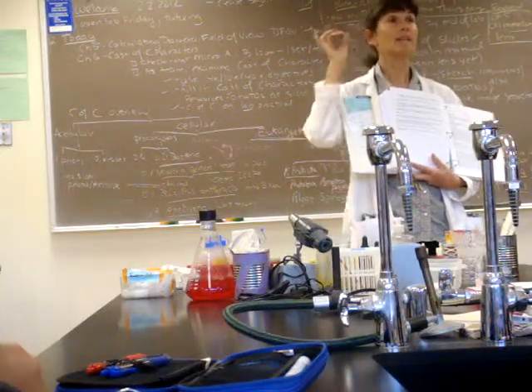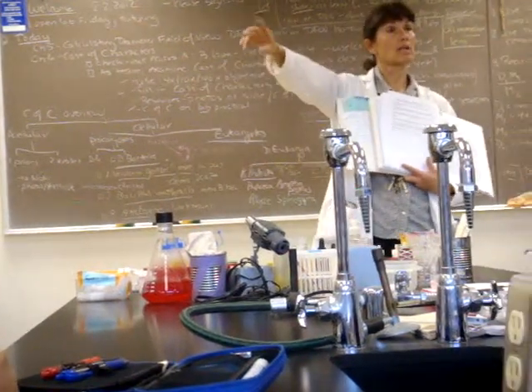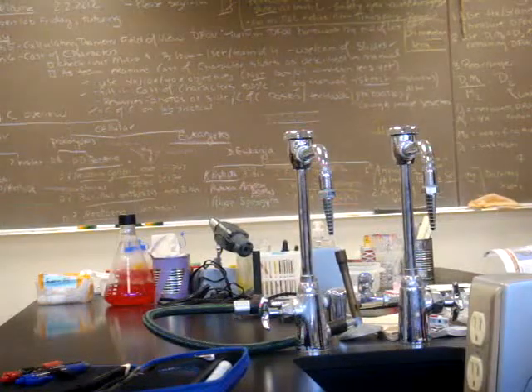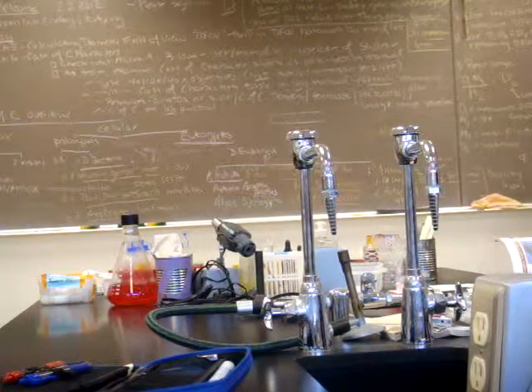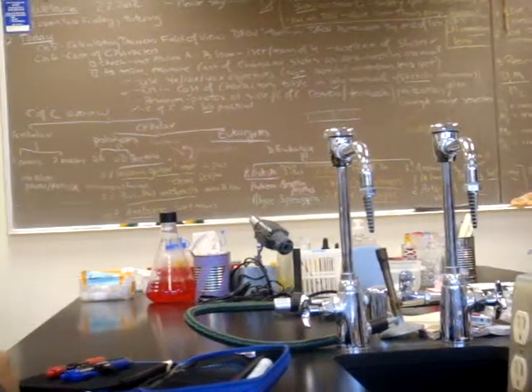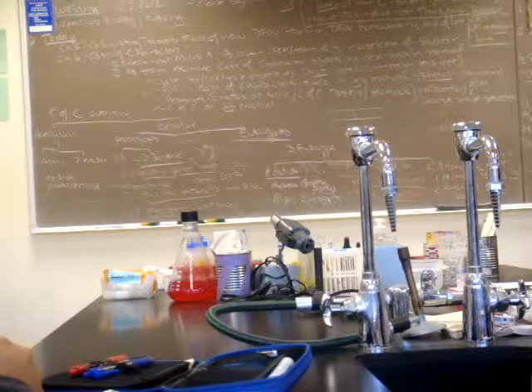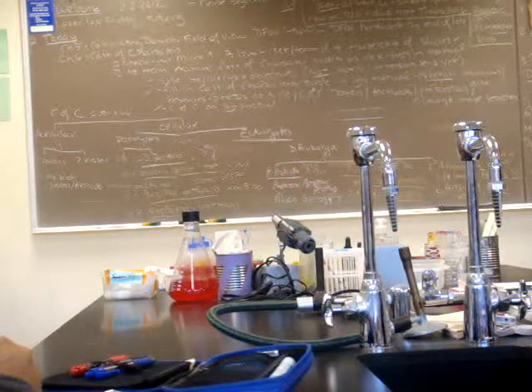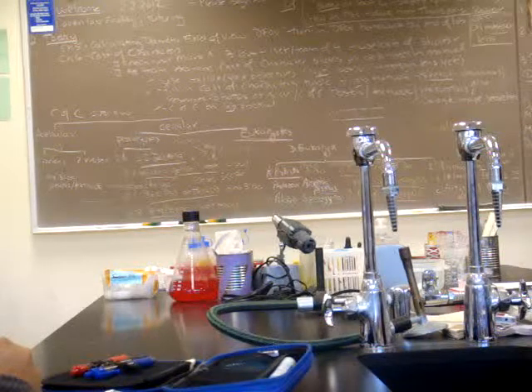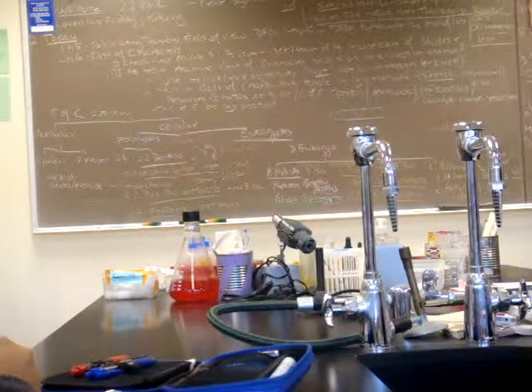Now, they're quite big. So I would recommend that instead of using your light microscopes, you use one of the dissecting scopes. These will slightly magnify the cysticercus, but it will give you a better idea of the entire structure. If you use your light microscopes, you're just going to see a little portion of the cysticercus, and it's hard to identify on the light microscope. So I'd use one of the dissecting scopes to look at the Taenia solium cysticercus.